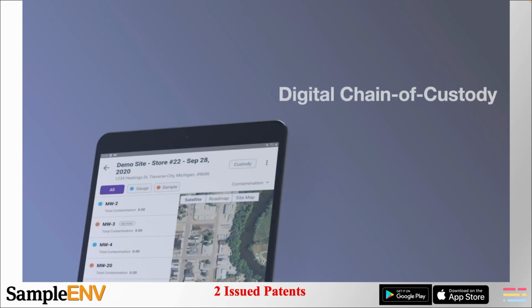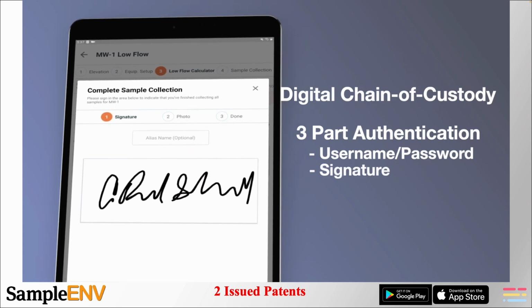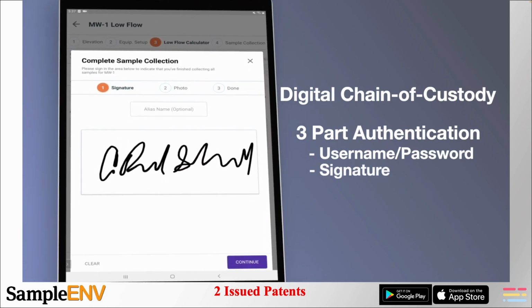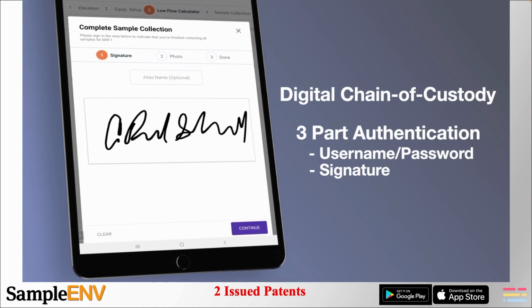For the chain of custody process, we use a three-part authentication on the field technician user. The first part is the technician's username and password. Everyone knows never give up your password. The second part is the signature on the device.